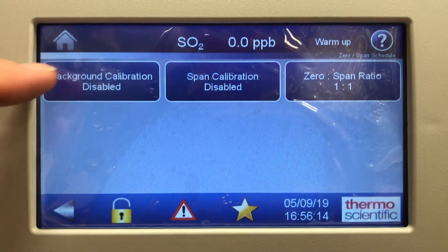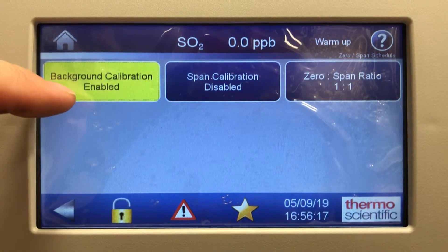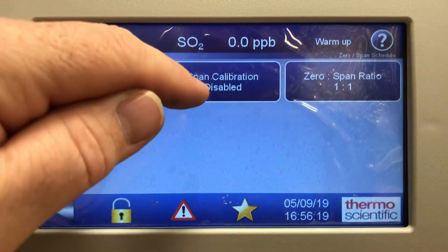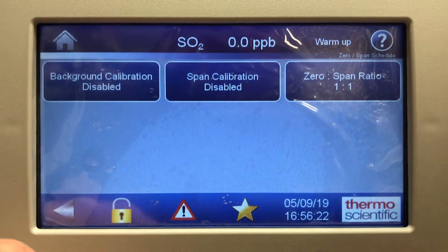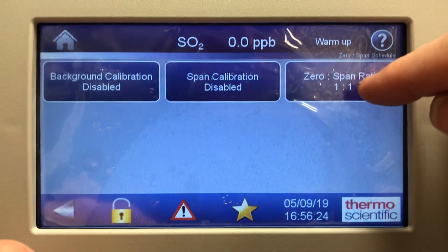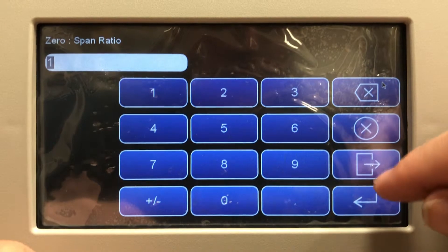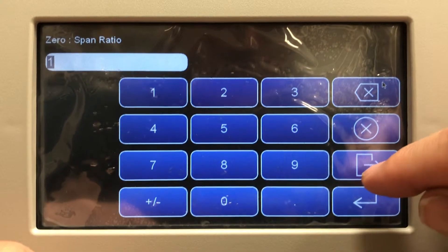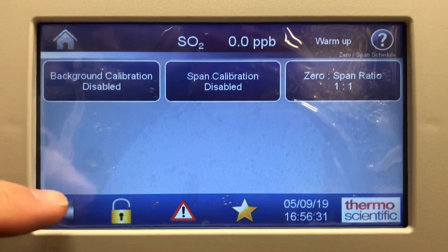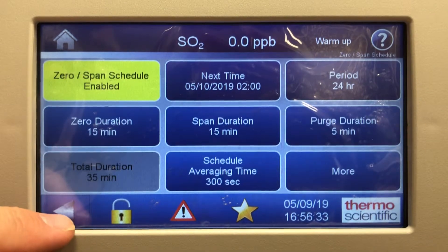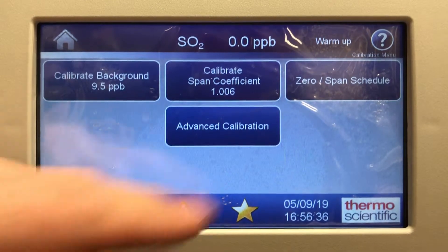Background calibration can be disabled or enabled, and span calibration can be enabled or disabled as well. The zero span ratio can also be changed — make it 10 to 1, 5 to 1, whichever you choose. That's the zero span schedule screen.